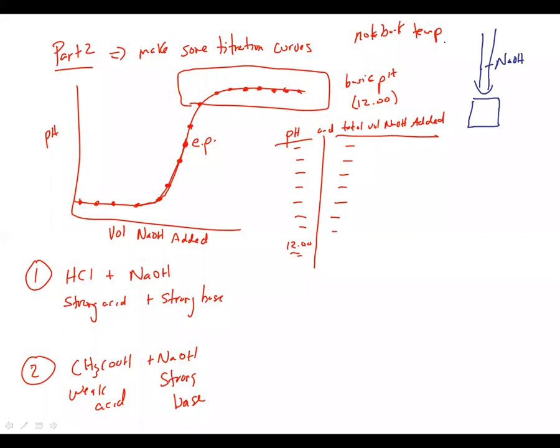Now, we did talk about this in class, right? So a couple of things you should know off the bat here, hopefully, is if you look at the titration curve for our strong acid plus our strong base. When you look at that titration curve, it should look like what we saw in class, and better than what I'm probably drawing here. It should look something like this.